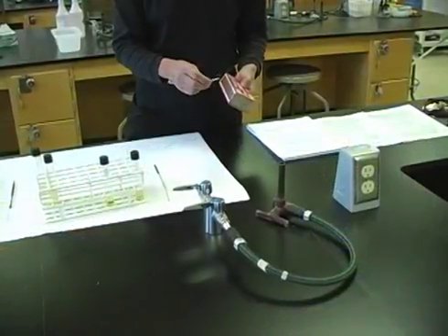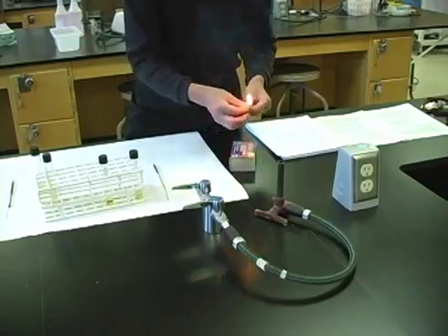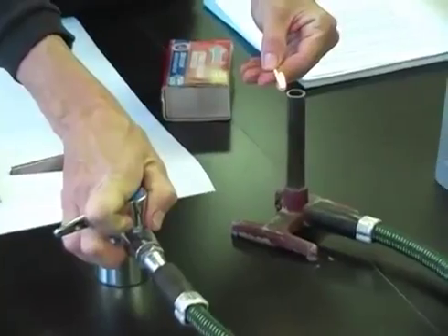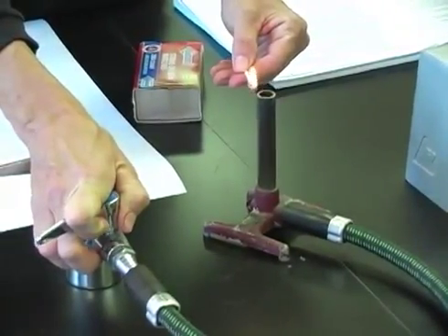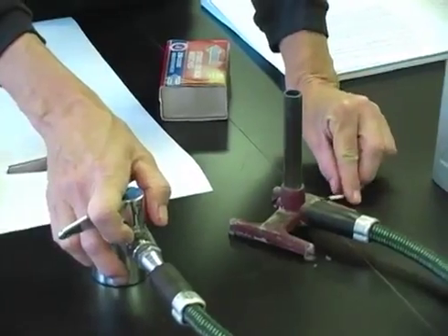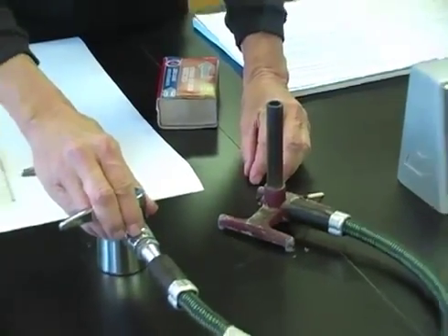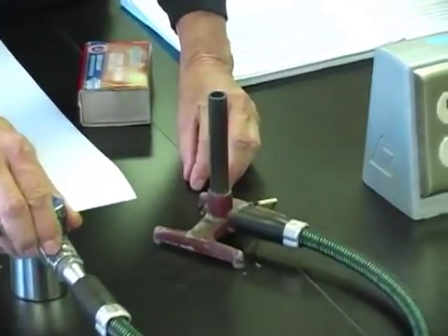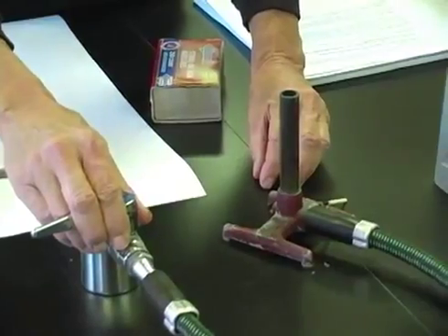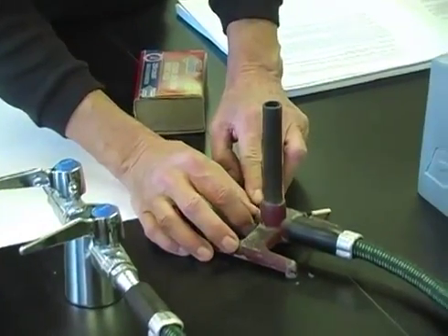I'm first going to sterilize my inoculating loop by flaming it. I'll light my Bunsen burner by slowly turning on the gas. I want to adjust my flame so that the height is approximately 2 inches. I'll adjust the air intake.